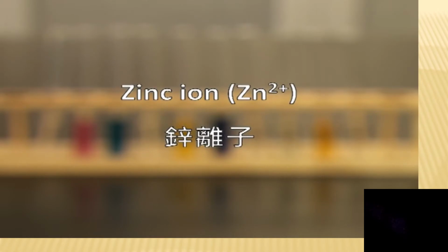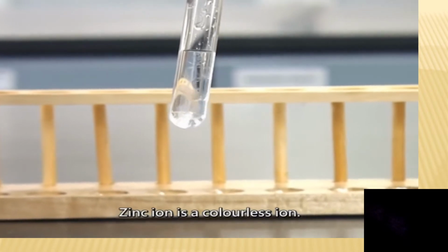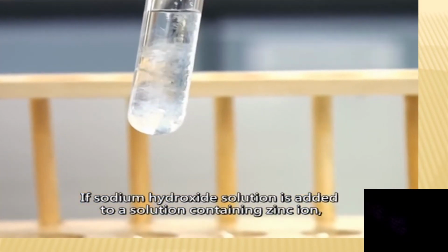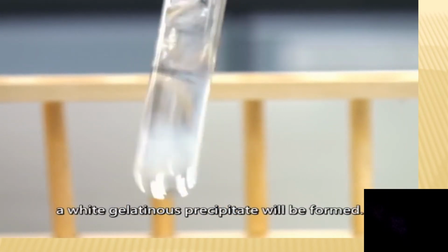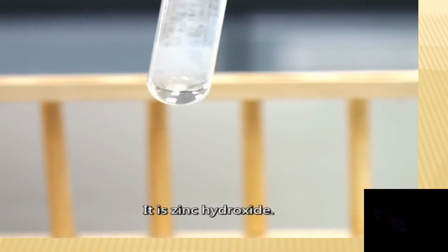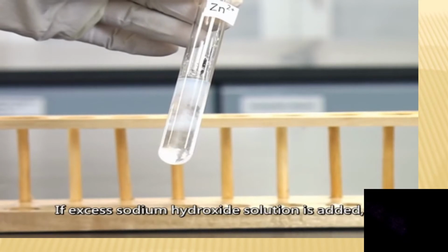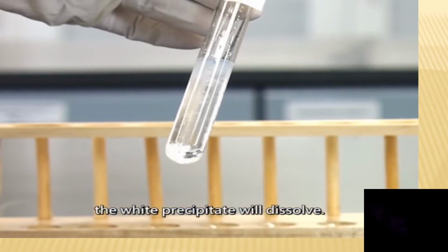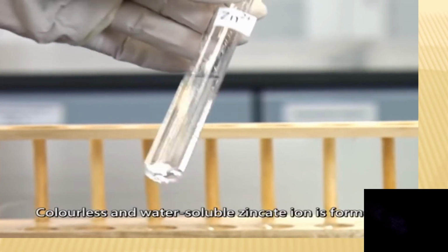Zinc ion. Zinc ion is a colorless ion. If sodium hydroxide solution is added to a solution containing zinc ion, a white gelatinous precipitate will be formed. It is zinc hydroxide. If excess sodium hydroxide solution is added, the white precipitate will dissolve. Colorless and water-soluble zincate ion is formed.